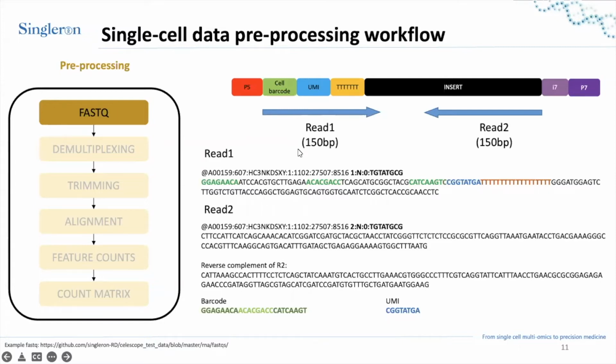Okay, so yeah, we are able now to map the cell barcode with the UMI as well as the poly-T tails. So here, from the read description, we know read 1 and read 2 are from the same pair, which means we know they are together. But the thing is, read 1 has this UMI and a cell ID, but read 2 doesn't have it.